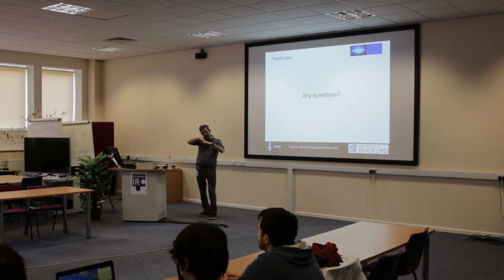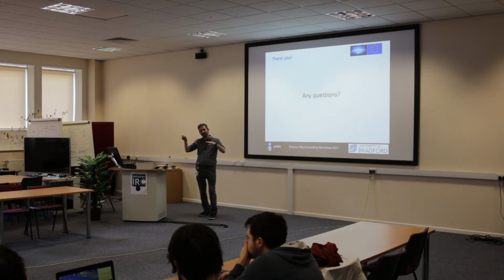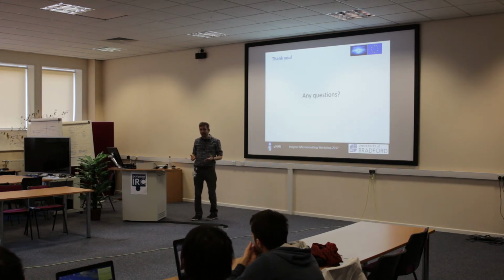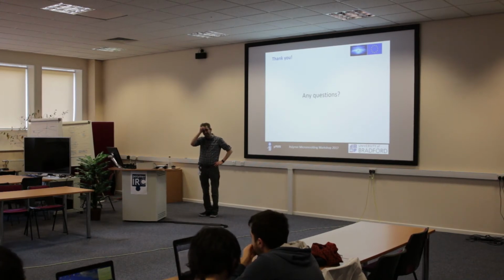To get the amplitude of your oscillation and also the frequency of your oscillation compared to your main ramp is complex. But there's stuff out there to help out, though it doesn't always work. And what are the pros and cons of having simultaneous DSC TGA, equipment with both?